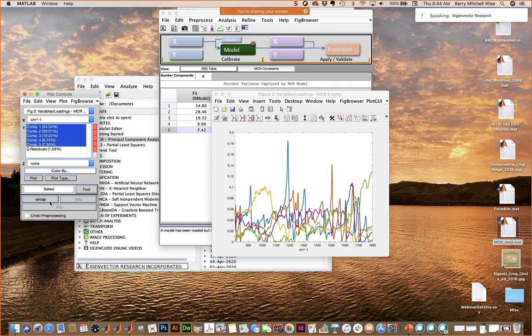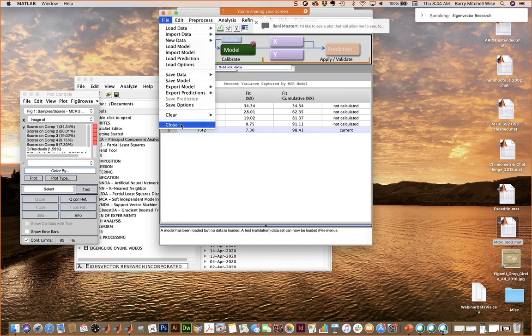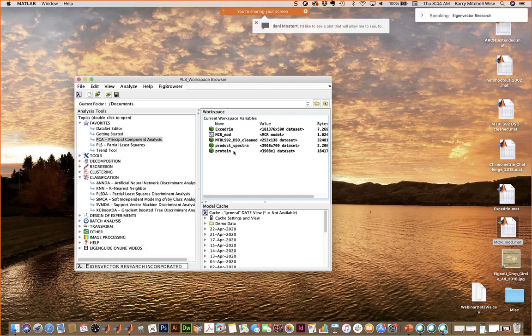But you can actually get a map here of, oh, I don't have my original data available for this, so I can't show that. You can show that for loads.